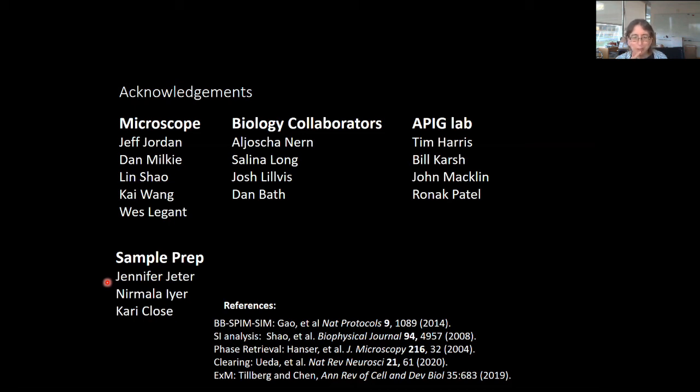As those samples get bigger, we are bound to encounter those problems. Sometimes you'll be able to fix them from the sample prep side, and sometimes you might need something to help you adjust the index of your immersion medium a little bit. And that 2 millimeter working distance objective I mentioned has a correction collar, so you can fix it from there. If you have built a sample where you can image some beads at the bottom of the gel, you can fix it from there. I see.